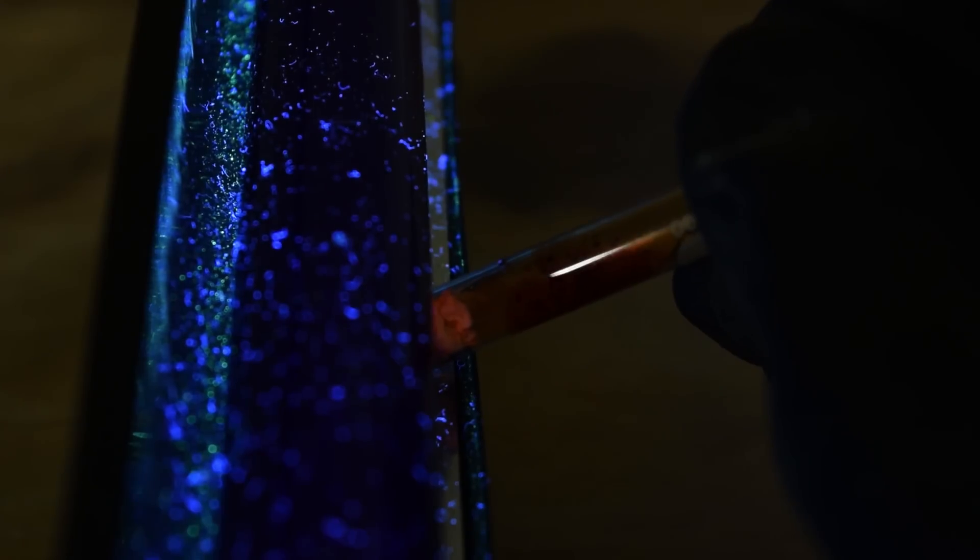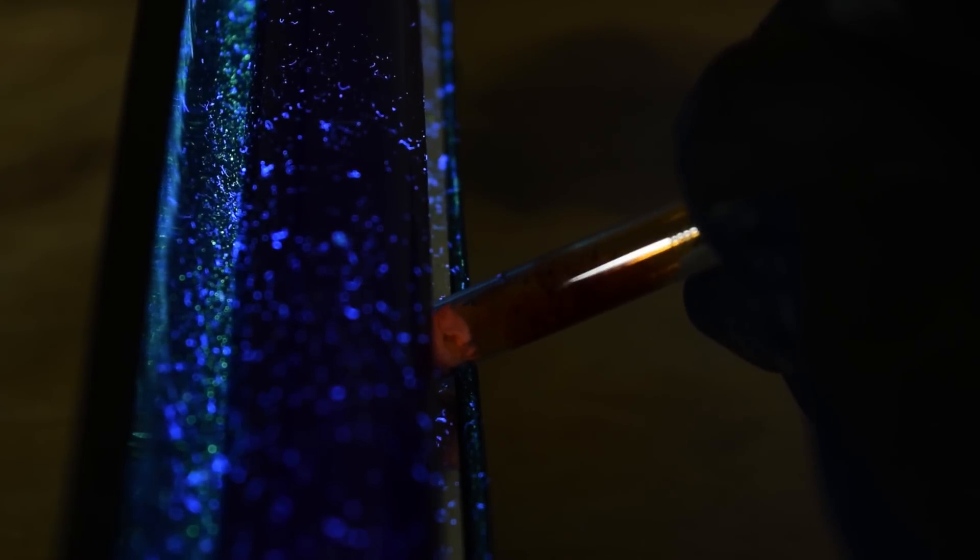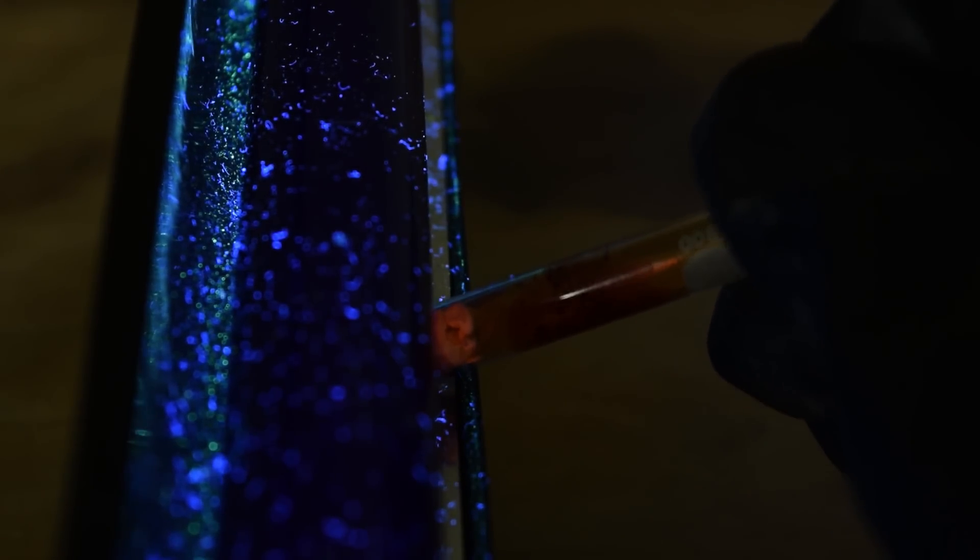The way that I can prove this is mercury-1-bromide is by putting it under a UV light. As you can see, it fluoresces this nice salmon color.